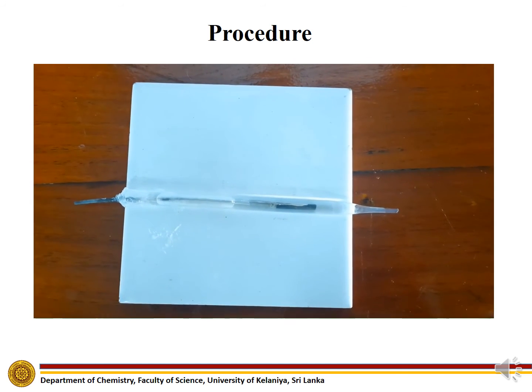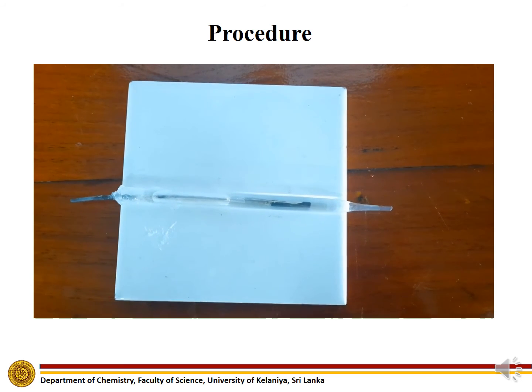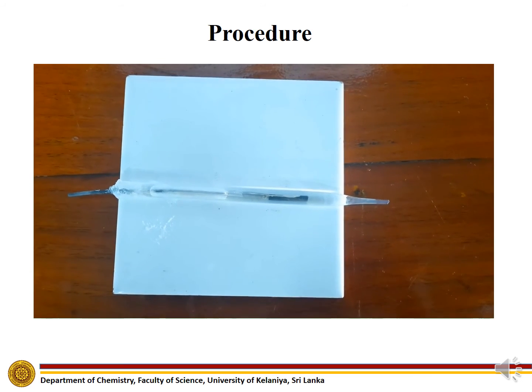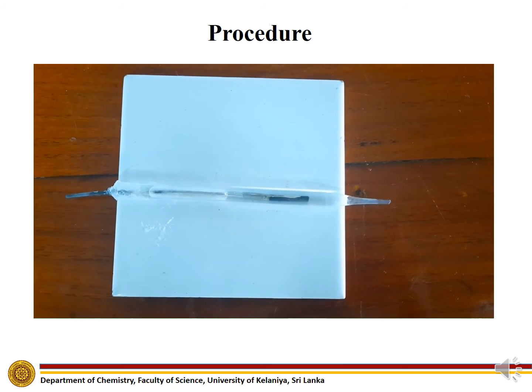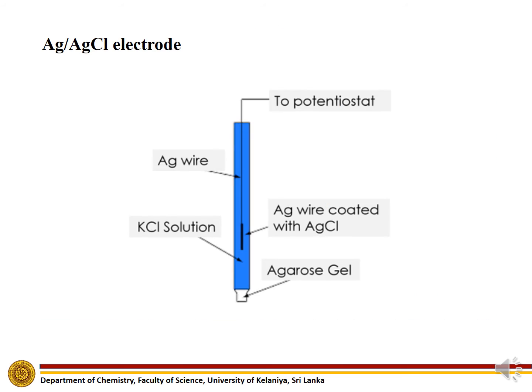This is the completed Silver-silver chloride electrode. This is a diagram of the Silver-silver chloride electrode.